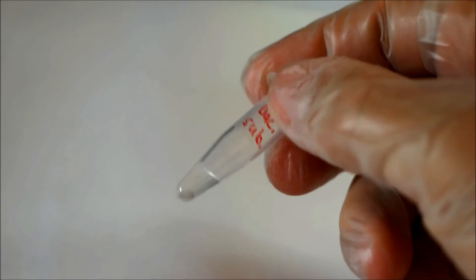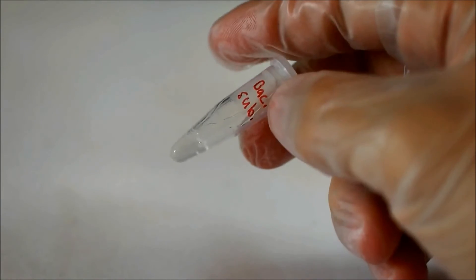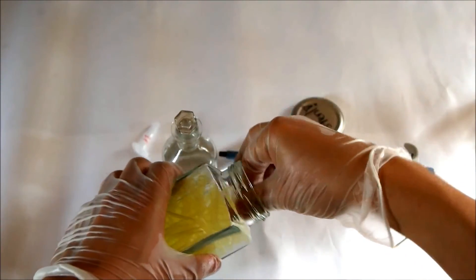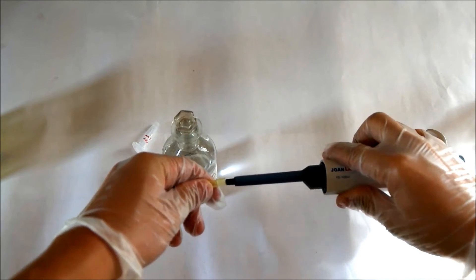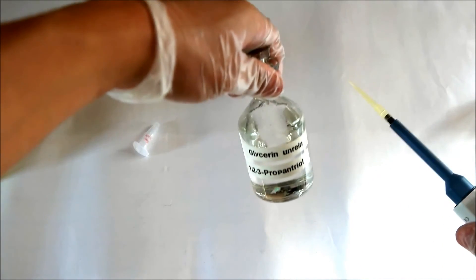Now I labeled the eppendorf tube with Bacillus subtilis and I will invert it a few times to get rid of the pellet. Now put an aseptic pipet tip on your pipet and fill the tube up with glycerol.